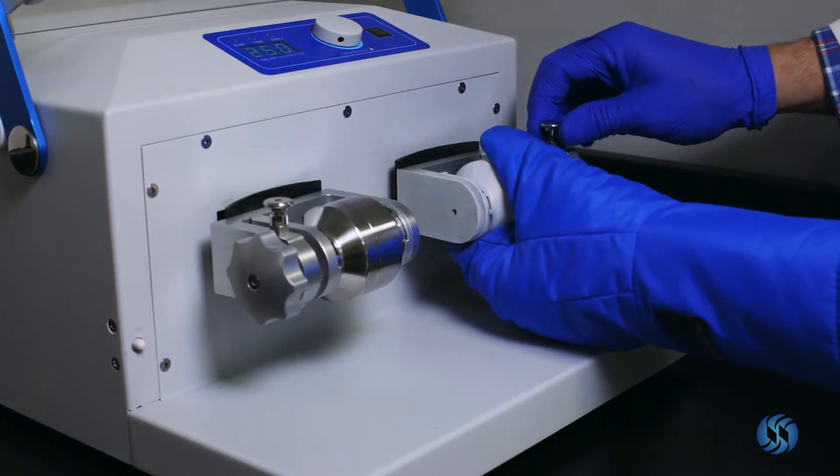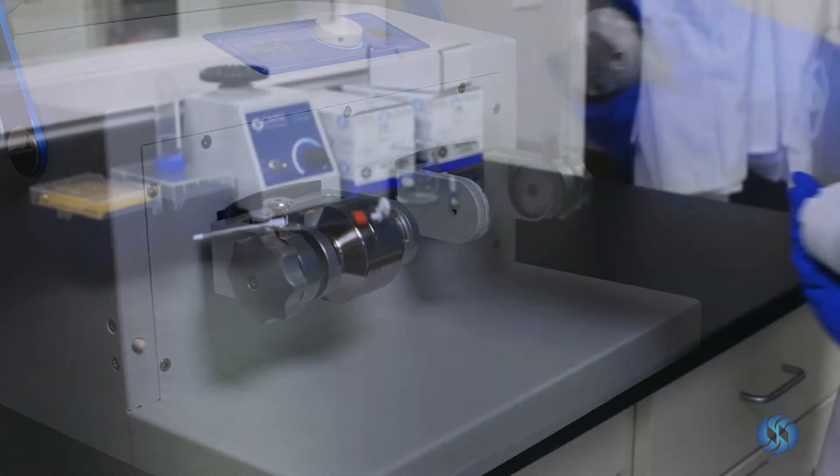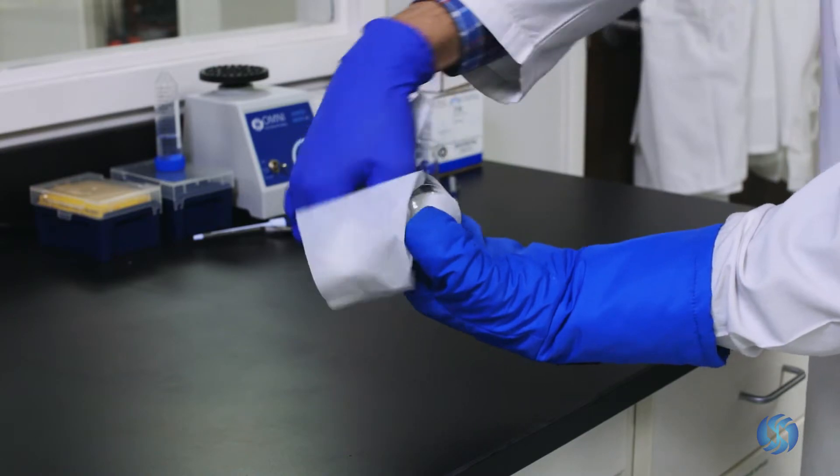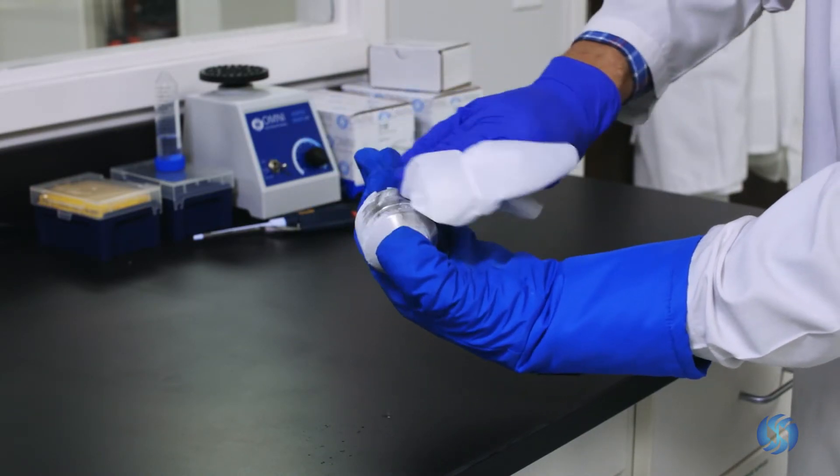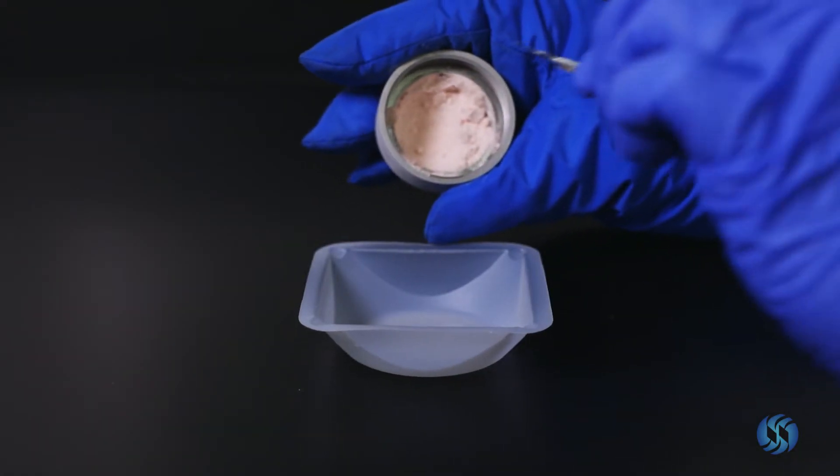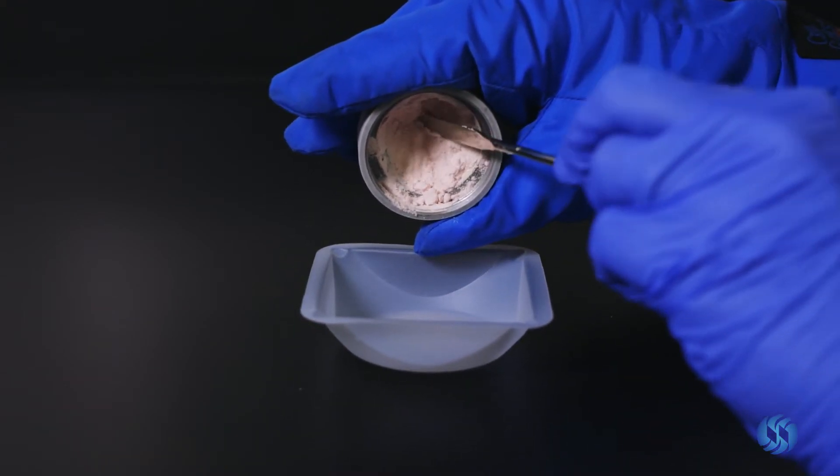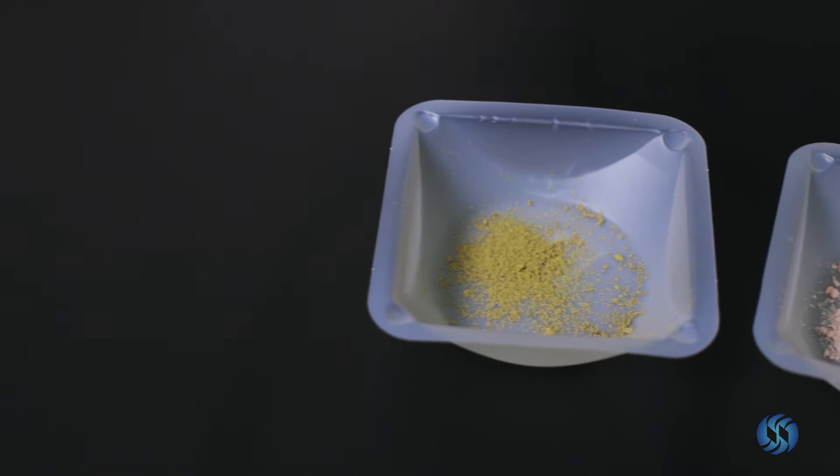Upon completion, unfasten the milling jar from the BeadRuptor 96 and remove any excess condensation. Your cannabis sample is now ready for testing.